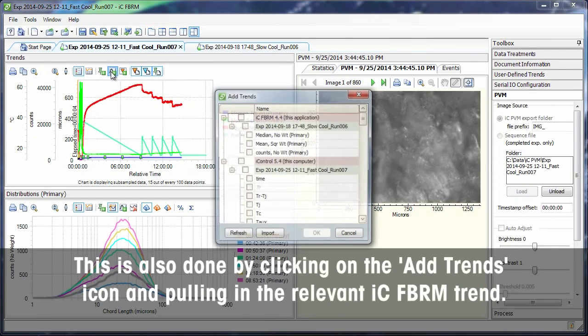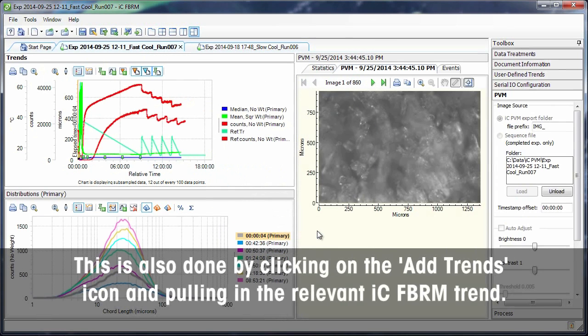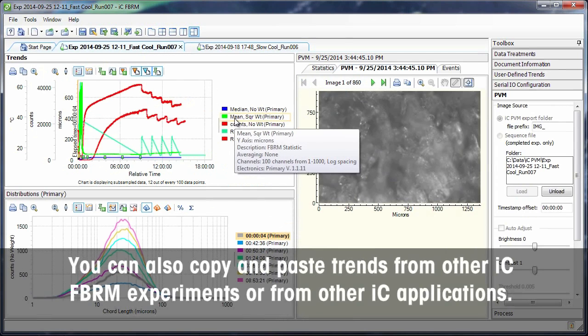This is also done by clicking on the Add Trends icon and pulling in the relevant ICF-BRM trend. You can also copy and paste trends from other ICF-BRM experiments or from other IC applications.